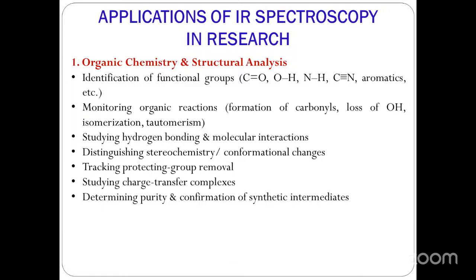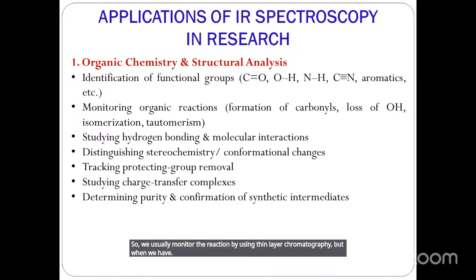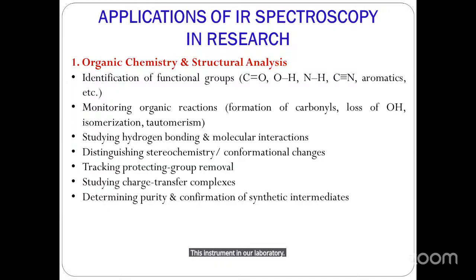We usually monitor the reaction by using thin layer chromatography. But when we have this instrument in our laboratory, we can monitor the reactions and we can see what kind of functional group change has occurred during the reaction. Whether the desired functional group change has taken place or not, we can confirm.